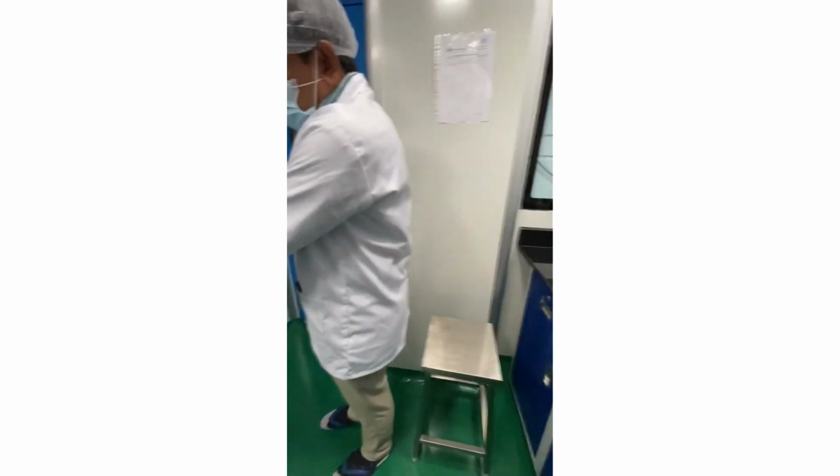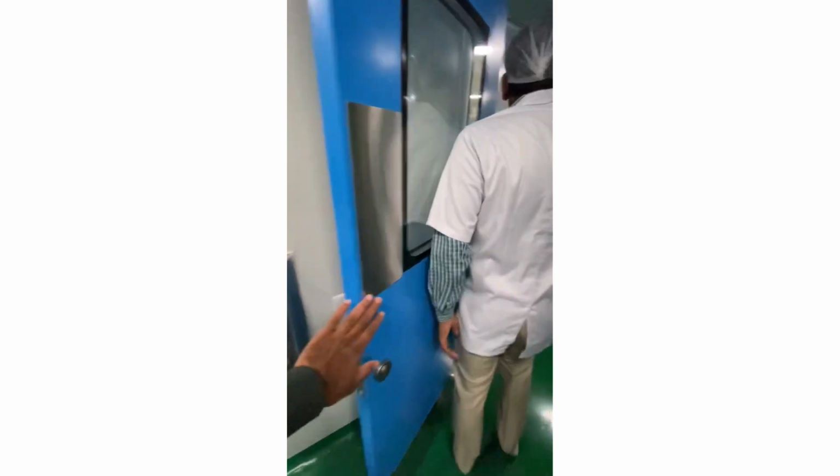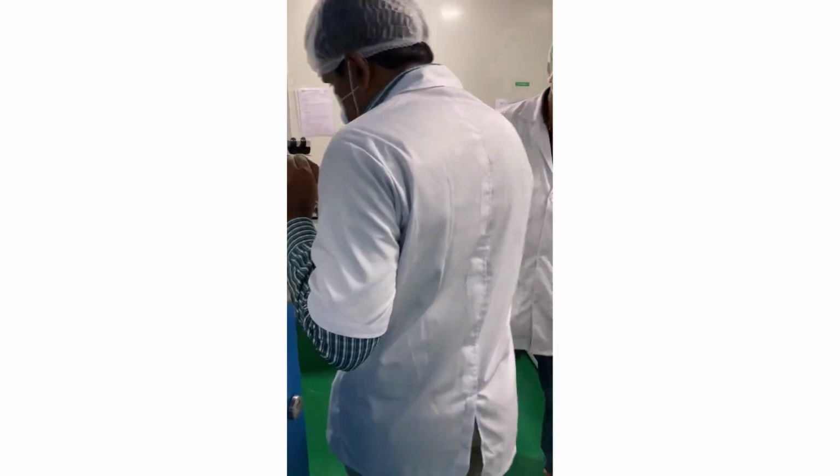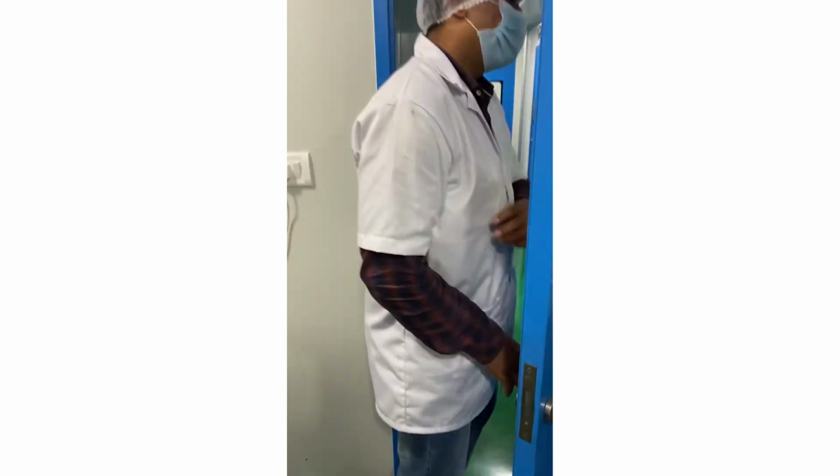After completion of the incubation period, we are taking the results, meaning the reports, and placing them through this pass box to that room. He is Mr. Umesh, working in our laboratory as an assistant.